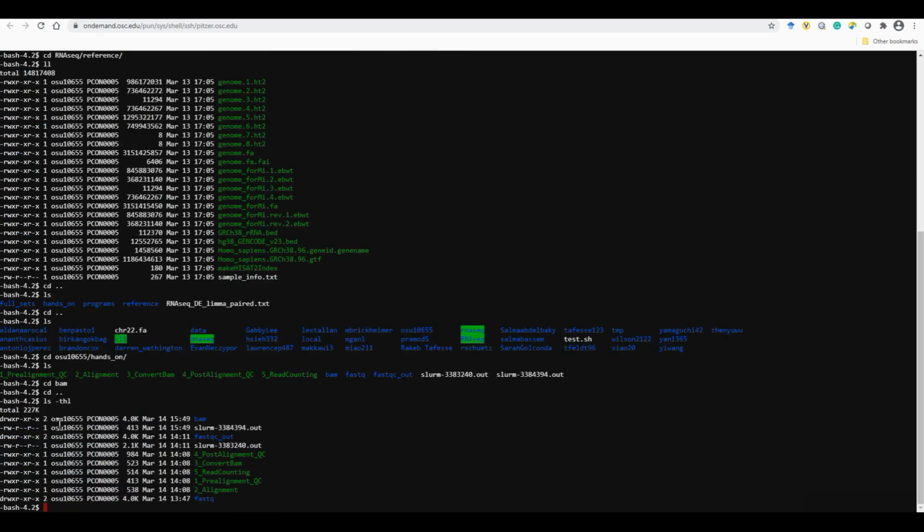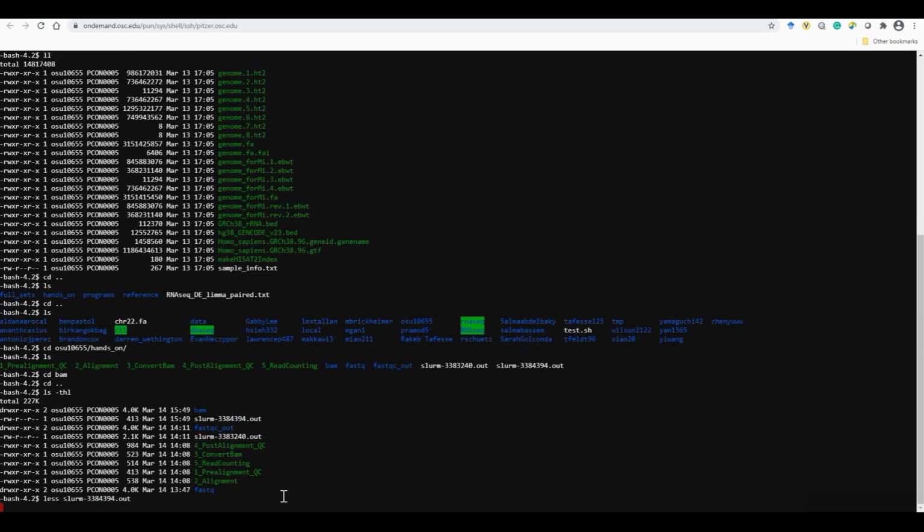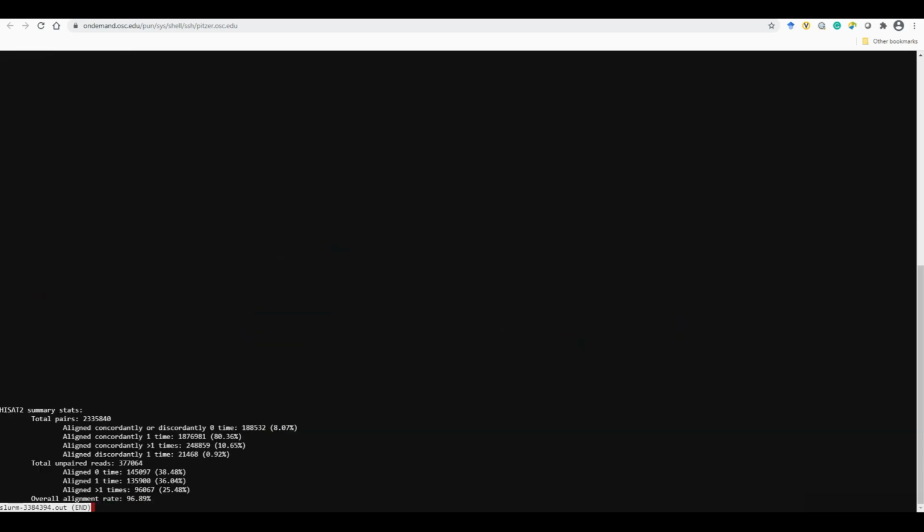Let's list it according to the time sequence, and this slurm file is the one I just submitted. Okay, so here is the HISAT2 summary and statistics.